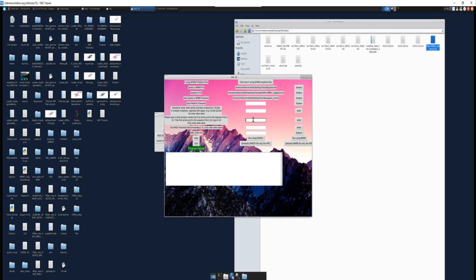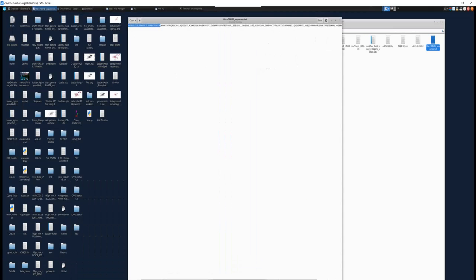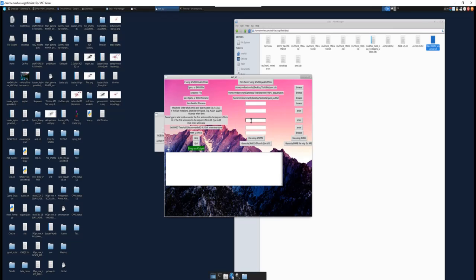But what you also want to do is put in the amino acid number, right? So in your sequence that we have here, what is the very first amino acid's number within the sequence? So this methionine that we have here, is this number 1? Is this number 2? And the numbering has to be identical to the PDB. So if you're, for example, working on a domain that's near the C terminus, and this methionine is in fact amino acid 200 in the PDB file, what you would put here is 200. In our case, it's just the very first amino acid.